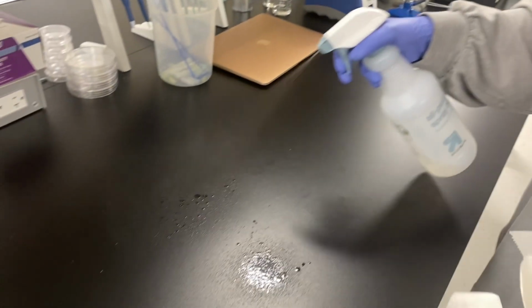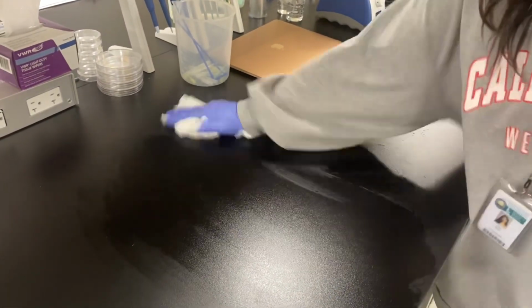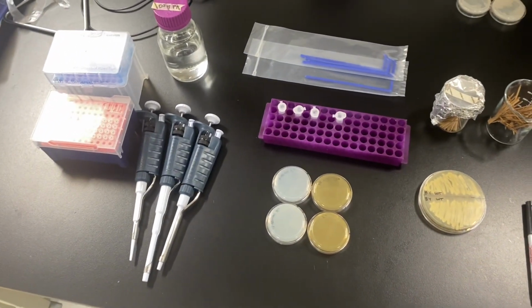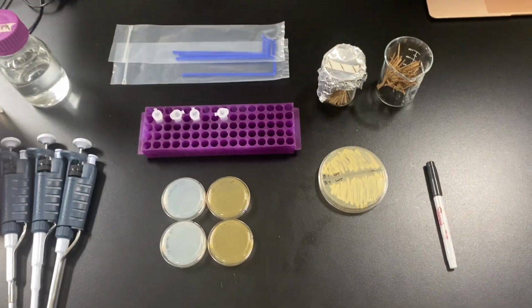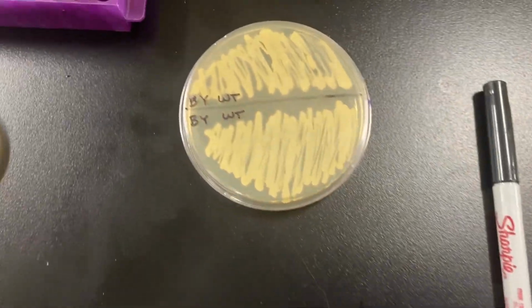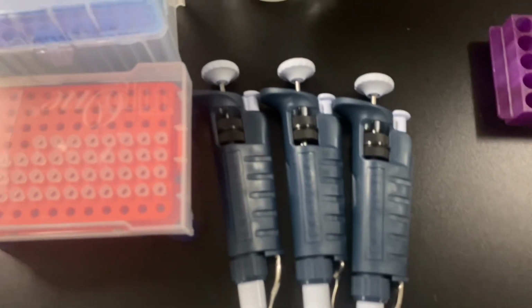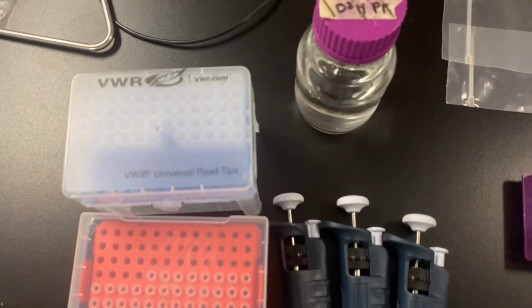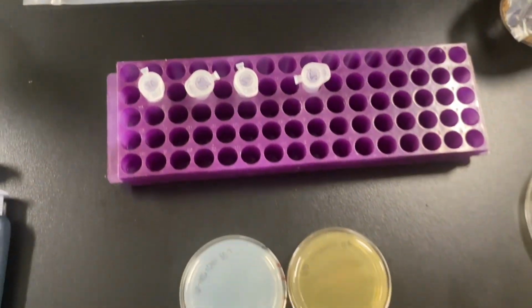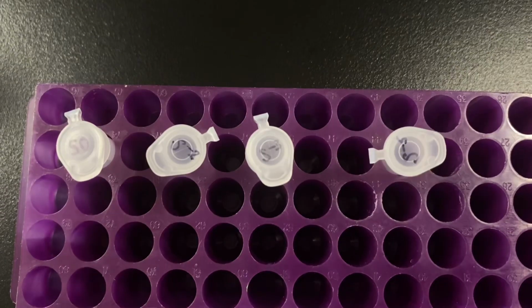To start off any lab work, it's always important to first clean up your lab station to prevent any confounding variables from affecting the experiment. To conduct this experiment, you will need a vortex. If you don't have access to one, I will show you alternative methods to homogenize your mixture later on. You will need a Sharpie, the wild-type culture that will be provided, pipette tips and pipettes, sterile water, sterile spreaders, 4 Eppendorf tubes, provided plates containing the YPD media and the SD media without arginine including canavanine, and sterile toothpicks.